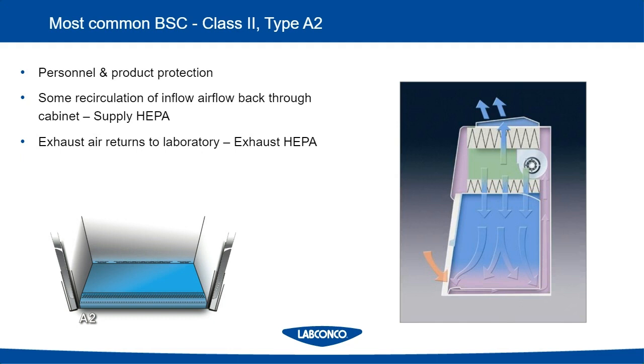Okay? The second issue arises in that some of my chemical, some of the airflow in the cabinet as it's passed over and picks up those fumes is not exhausted, but is pushed back down through the supply HEPA filter into the cabinet. So one could imagine a possibility where over time, if I was working with a large volume of chemical, since all of this air is not exhausted, it can start to increase in its concentration inside the cabinet.